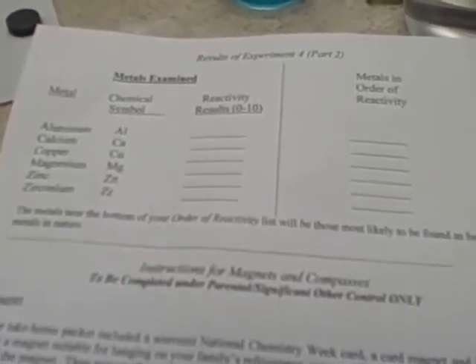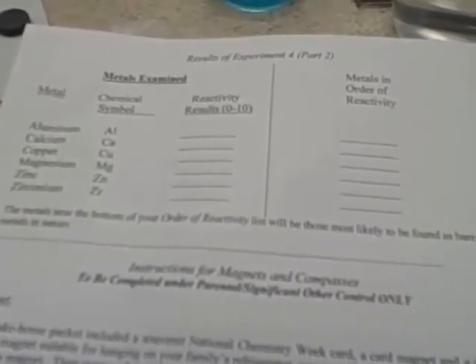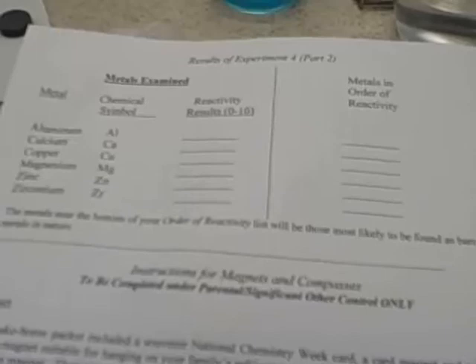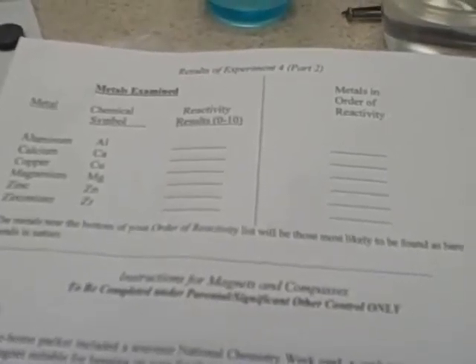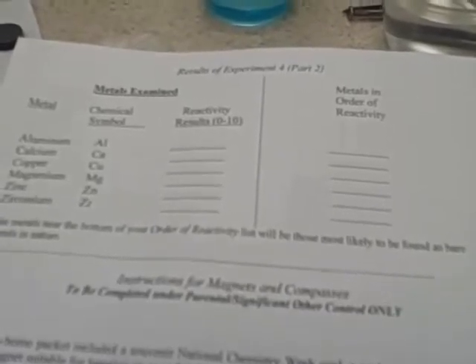Okay, how are you guys doing over here? You got all the samples in there? Okay, one more. Okay, I'll give you about 30 seconds to observe the reactions that you're getting.